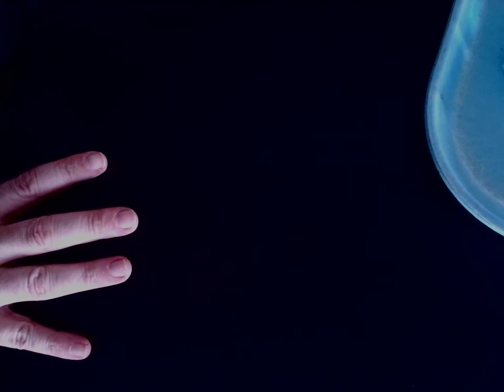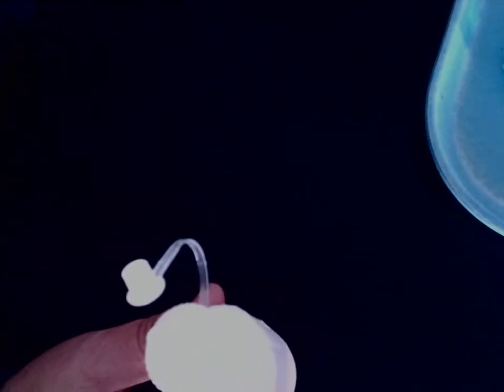Next one is going to be sodium carbonate with sodium phosphate.